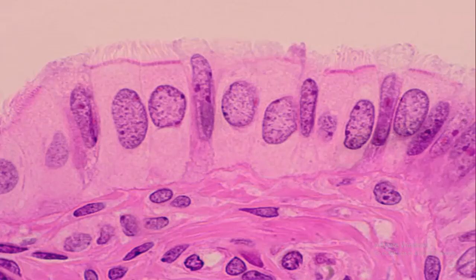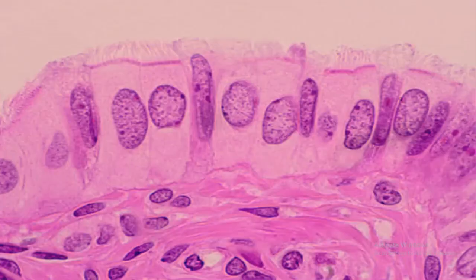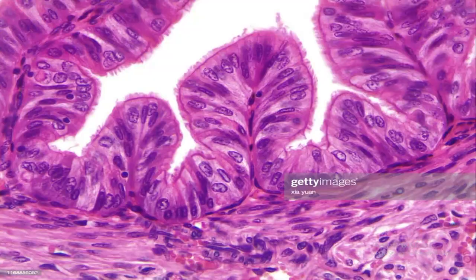Then you can also talk about this slide. What type of epithelium is this one? I'm sure someone can easily tell that this is the columnar epithelium, which is the ciliated columnar epithelium. Then we also have this epithelium, which is also a columnar epithelium.